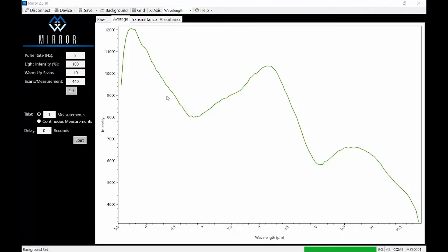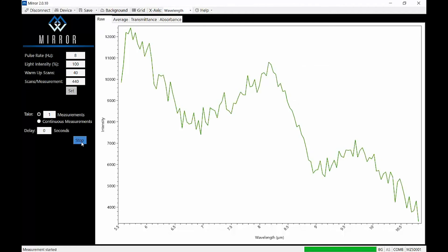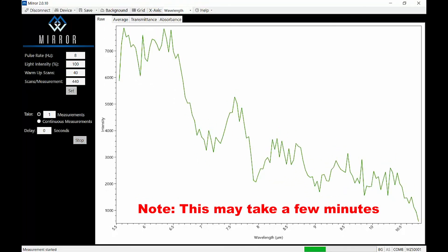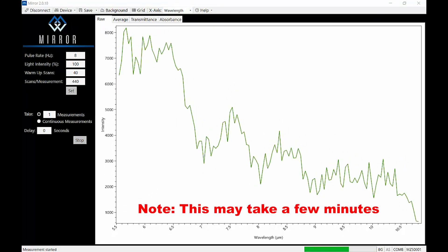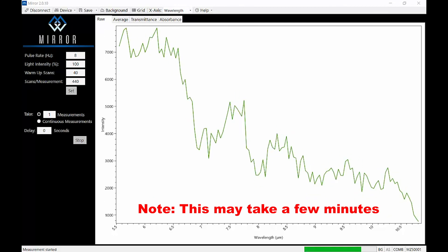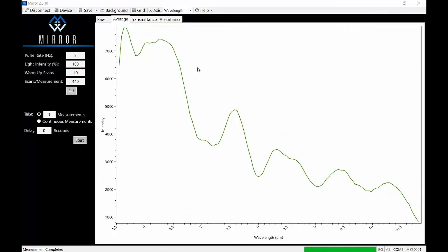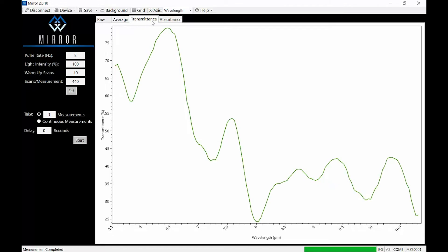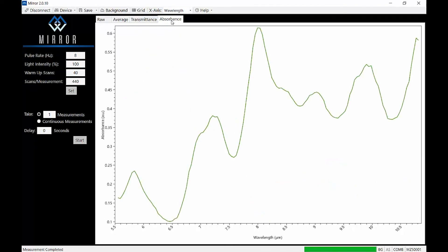Once you've loaded your sample, set the number of spectra you want to acquire and the save parameters, click Start and the raw data will be displayed in real time under the Raw tab. When the spectral acquisition is finished, the average raw data will be shown in the Average tab. Since you saved your background, you can see the more meaningful transmittance and absorbance spectrum.